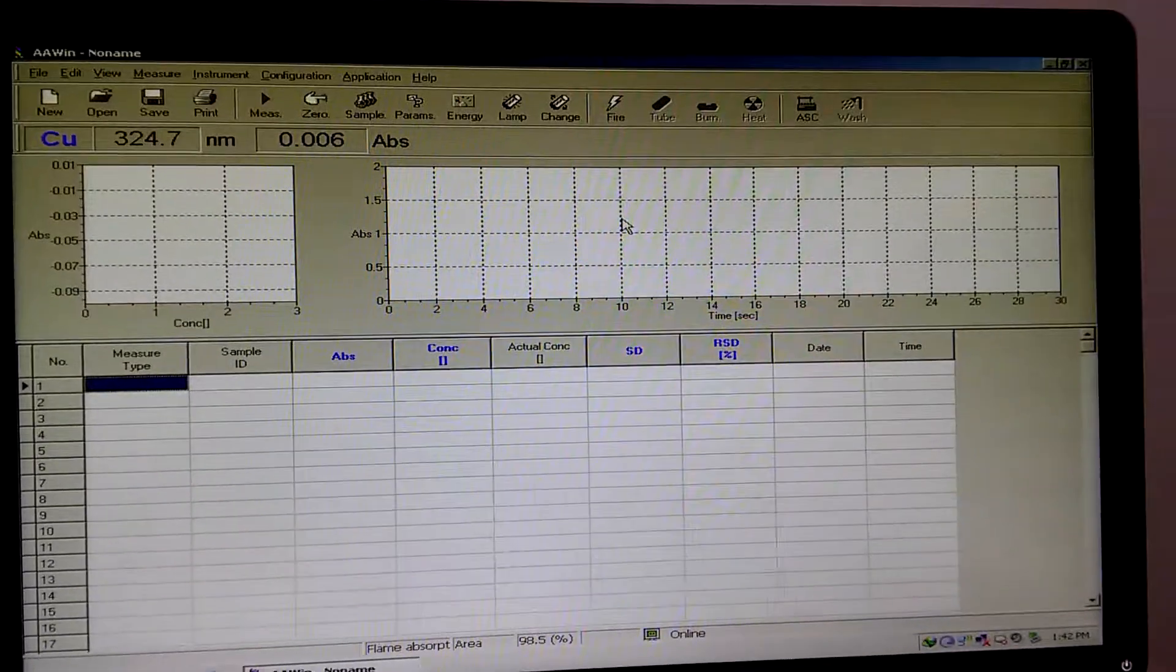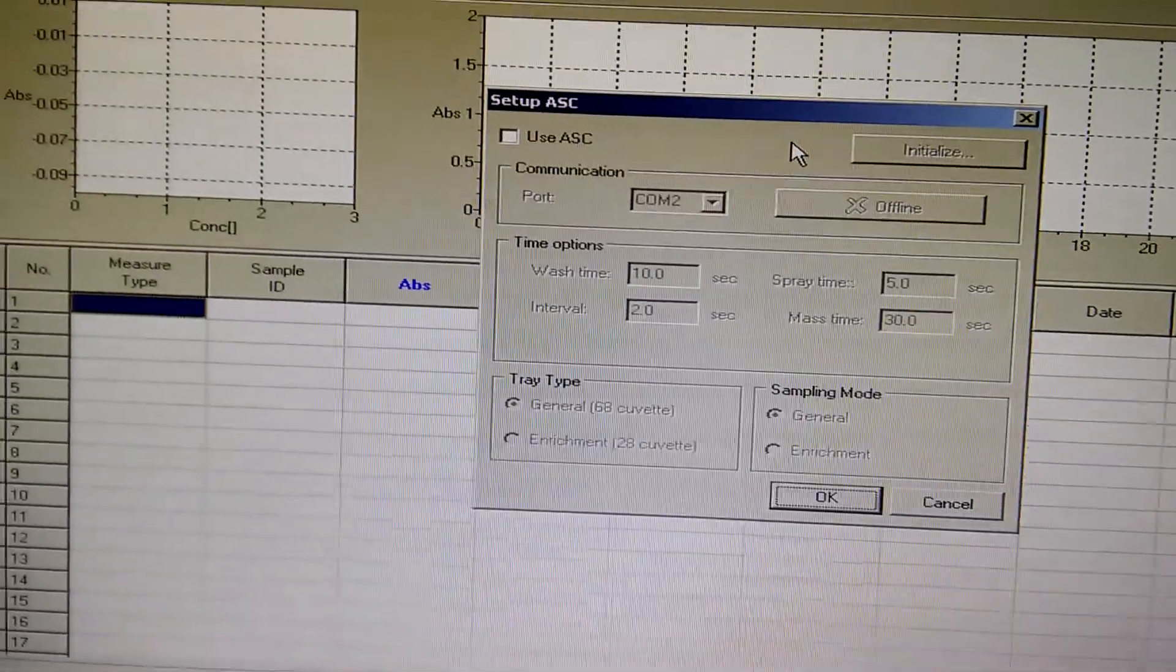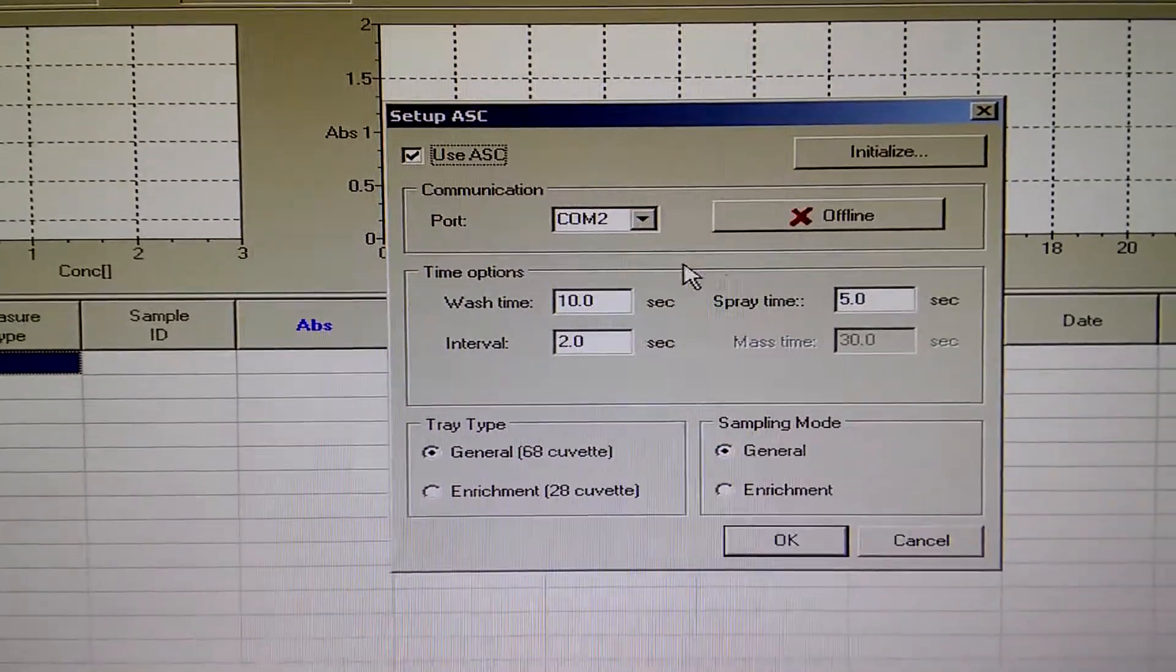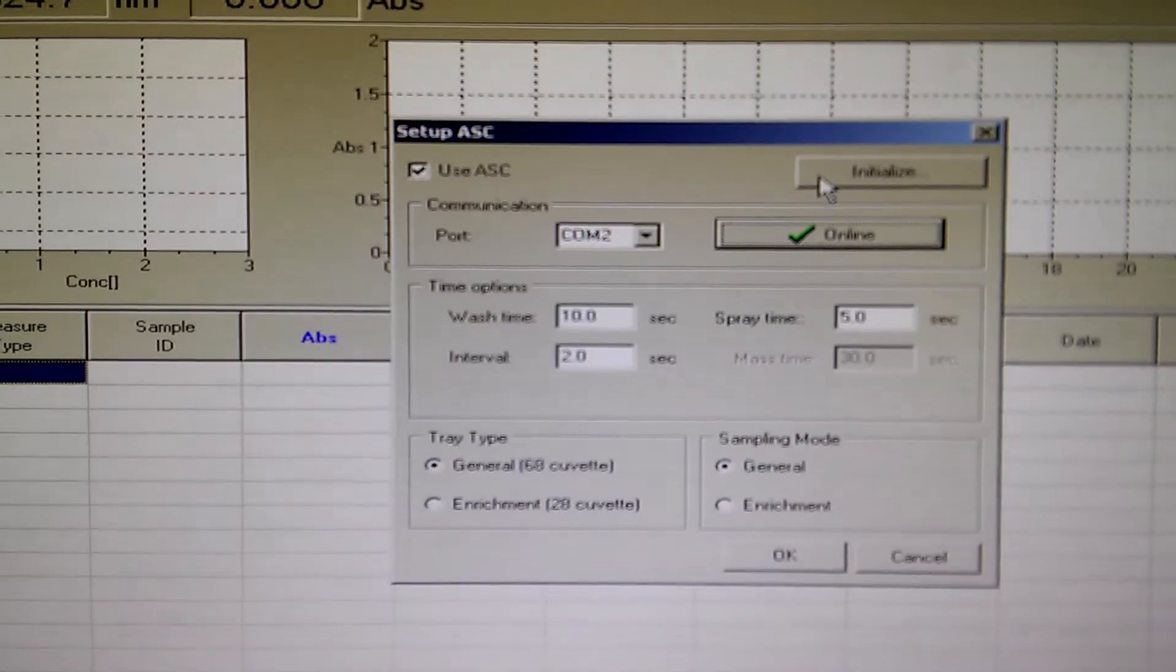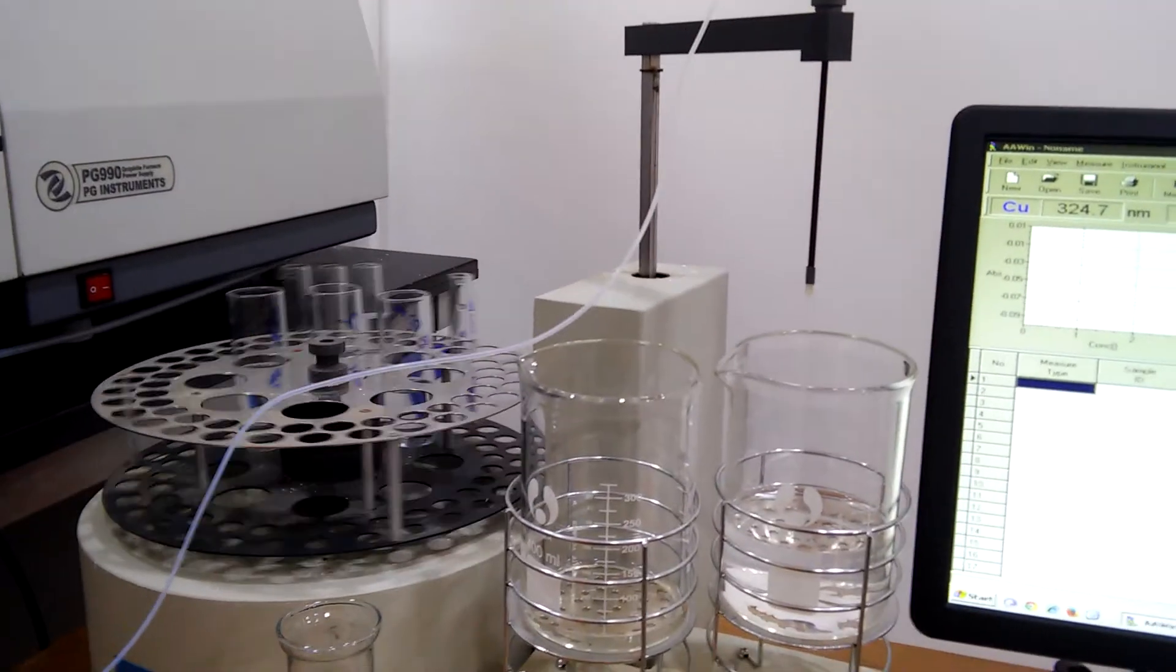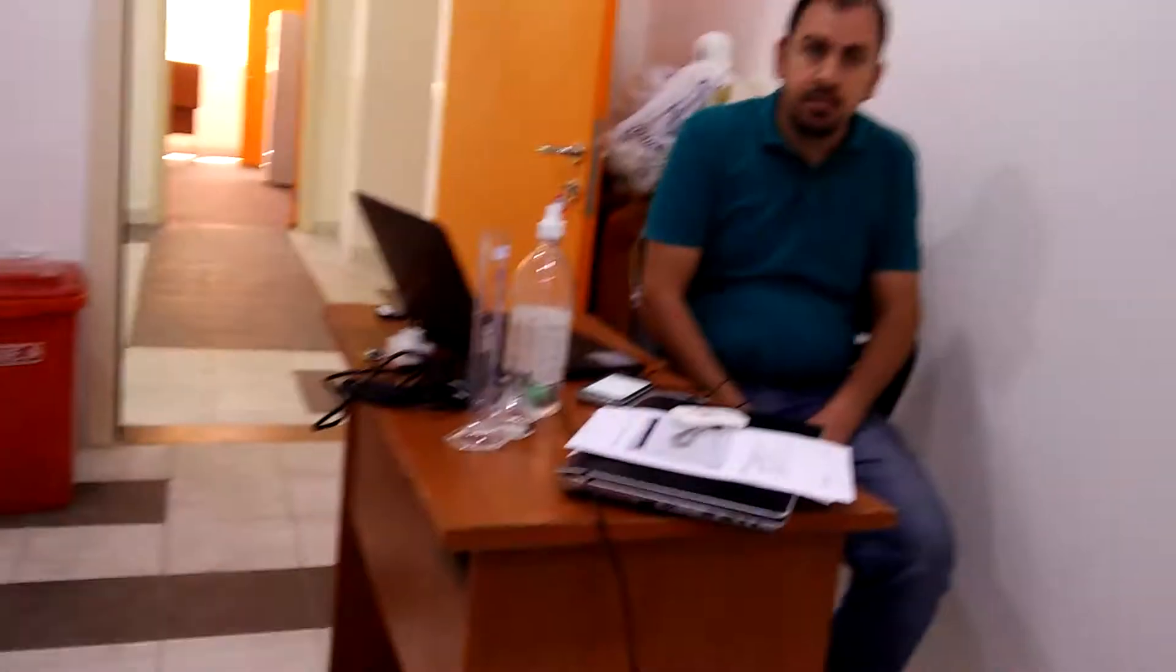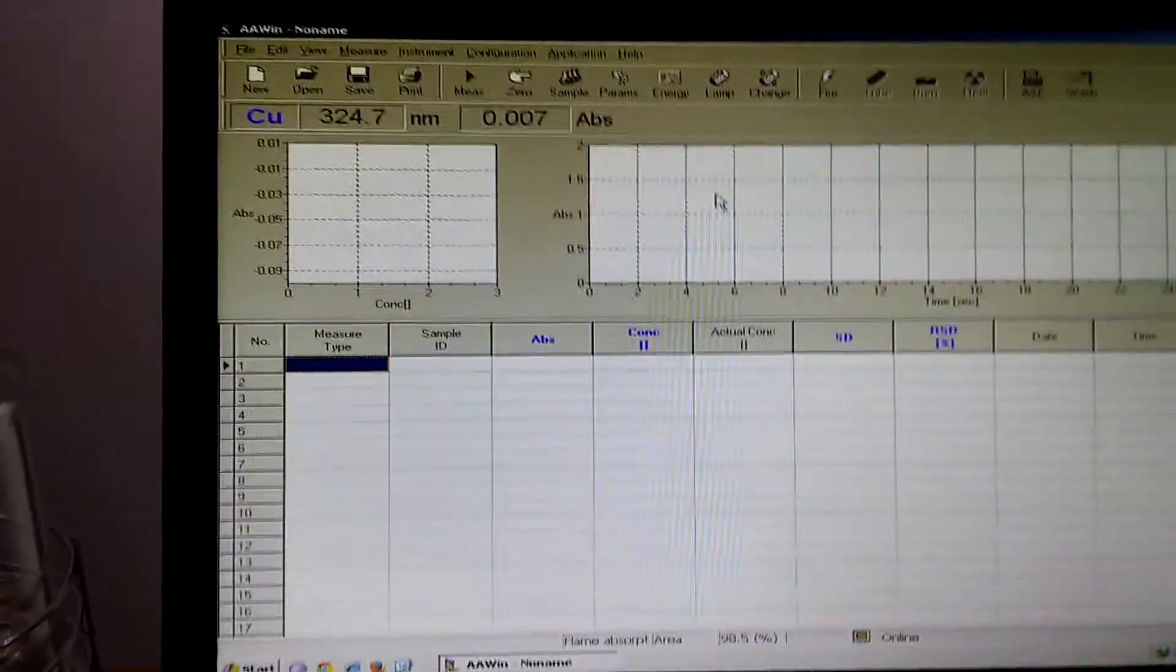Now let's connect the auto sampler. This is the auto sampler button, press it. Now tick this option. Make it online, initialize it, and it's working. Of course, thank you to engineer Ahmed who is setting up the auto sampler. That's okay.